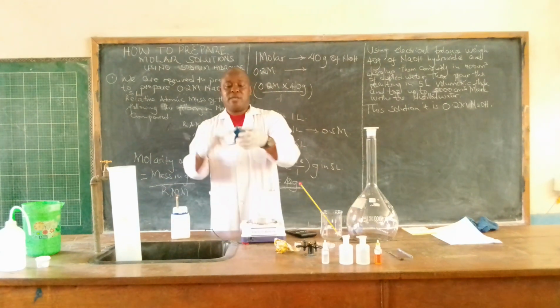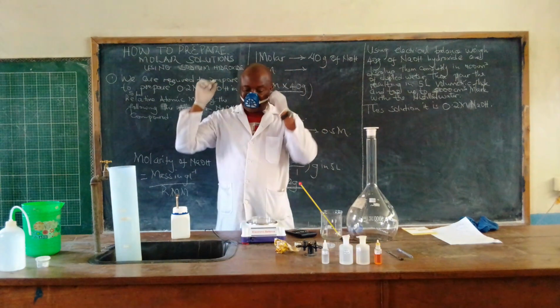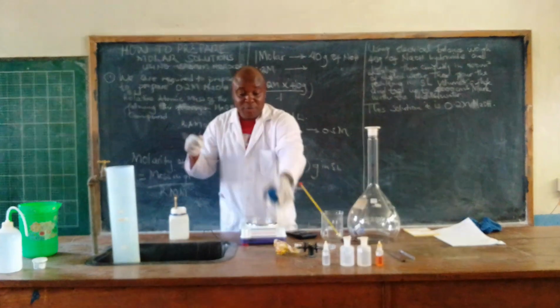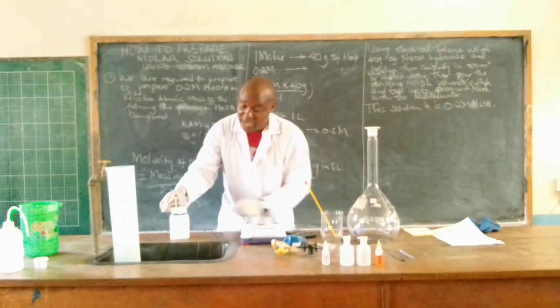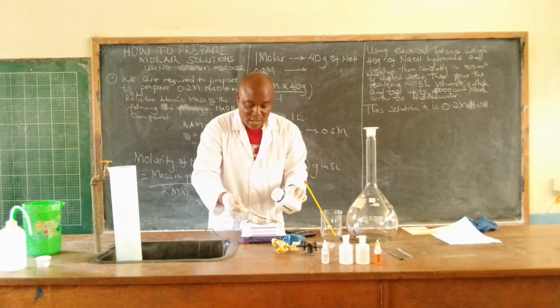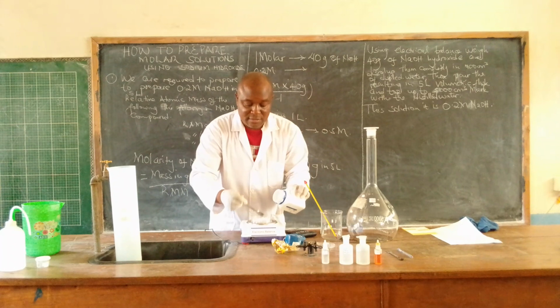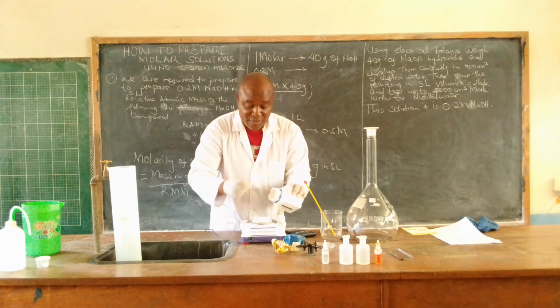I'm forgetting to put on my mask. I will put it on during the reaction with the distilled water. So I'm weighing 40 grams. You do it very fast.